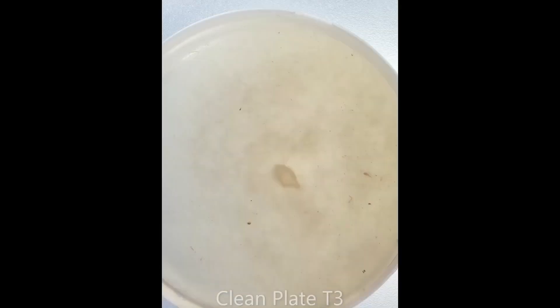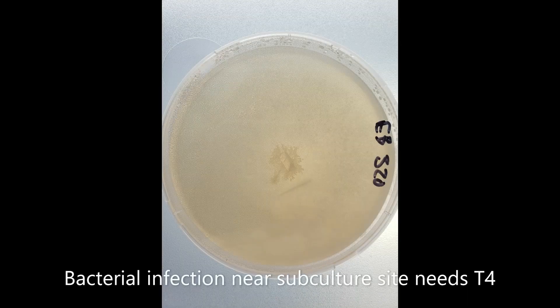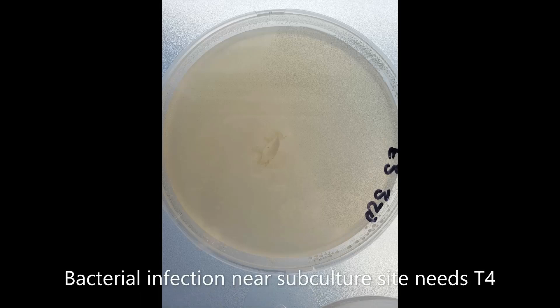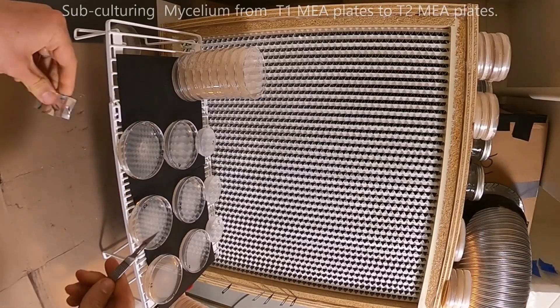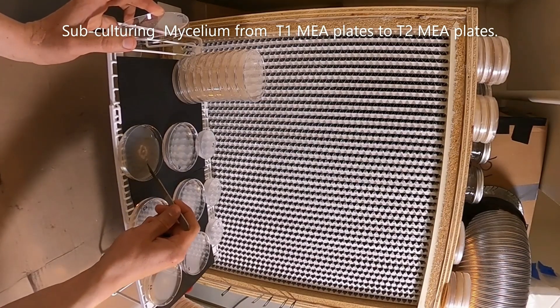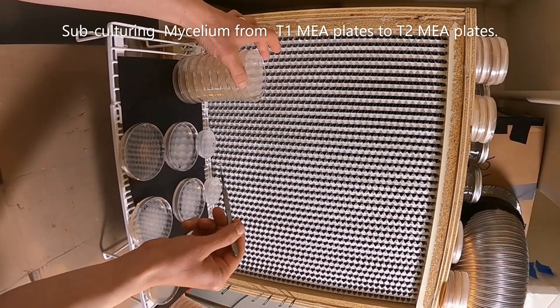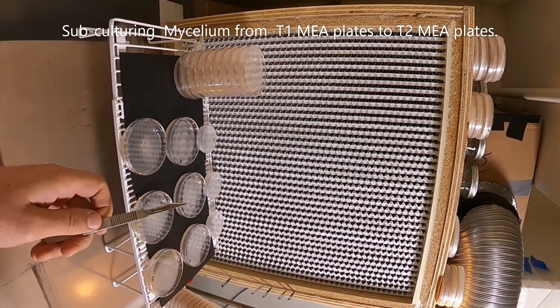Here we have the first clean plate — no bacteria around the subculture. This one's also clean. This one, you can see the bacteria kind of tracing along the mycelium lines, and it has a small infection in the center as well. This one has a small infection, and this one has a small infection too. So I'm going to take from the leading edge of the mycelium, kind of near the edge, and transfer that to a new clean plate of malt extract agar.